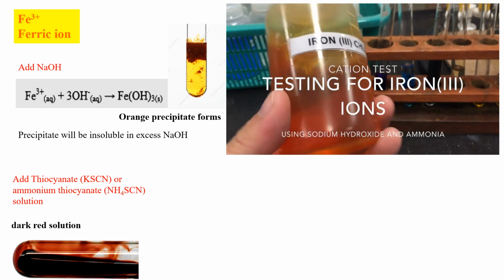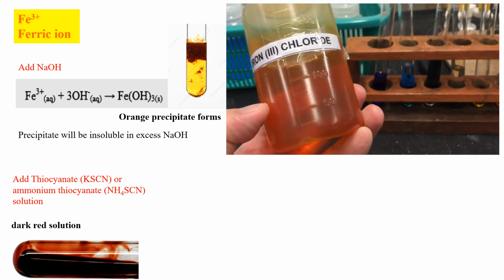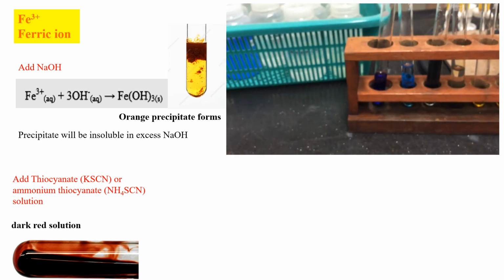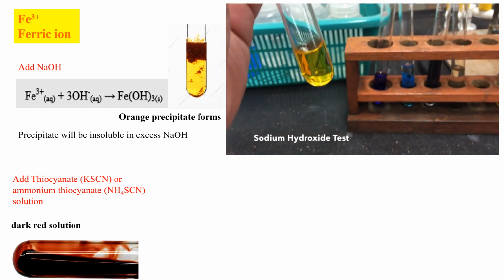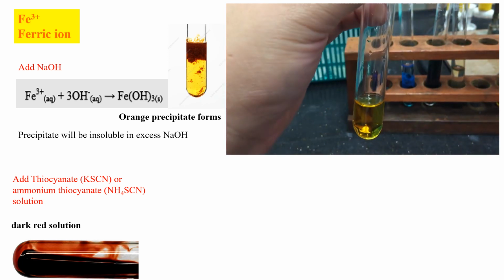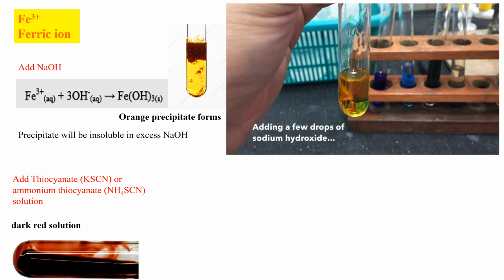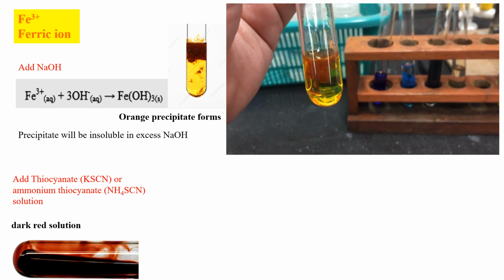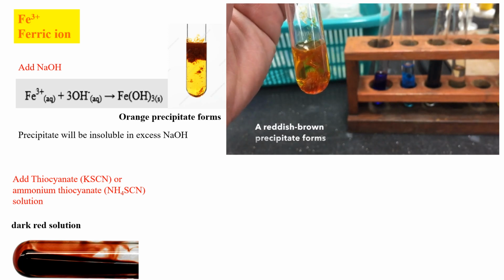Solutions containing iron 3 ions are typically red brown, orange, or yellow in color, depending on the concentration of iron 3 ions. To test for the presence of iron 3 ions, we may employ the sodium hydroxide test. To a small sample of the solution, add a few drops of sodium hydroxide. You will notice that a reddish-brown precipitate forms.